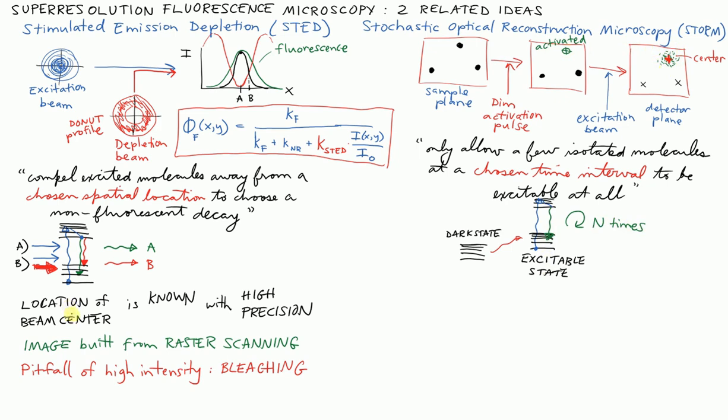What's the parallel to this statement about how you get location accurately? In this case, it's really that we're figuring out where single molecules are. Because we know that this cloud has been caused by emission from a single fluorophore, that's what's giving us our super resolution. We have this incredibly small light source here, way smaller than the diffraction limit of focusing light.